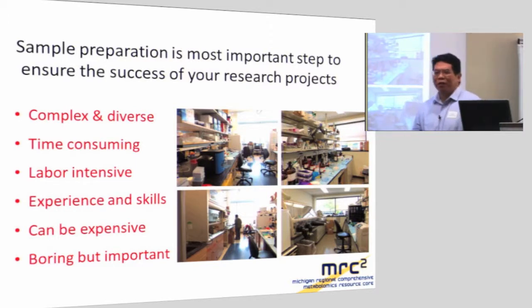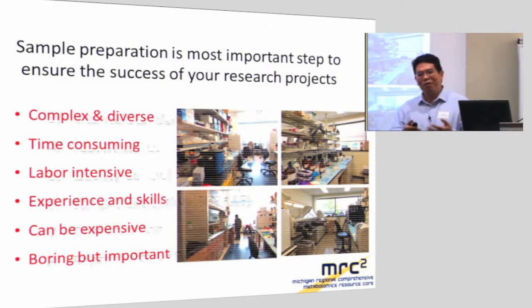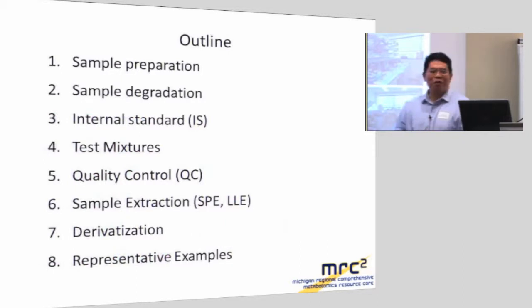It's very time-consuming, labor-intensive, and you need experience and skill for different sample extractions and preparation. And sometimes it can be expensive, because if you add in internal standards or you buy authentic standards to confirm your final structures, the cost will add up. And of course, sometimes you can see the students doing the sample preparation because it's very boring, it's physical, but it's very, very important. It is the foundation of the success of your project.